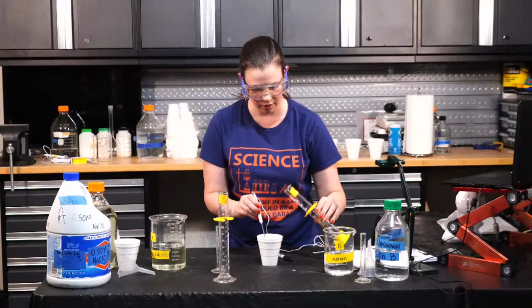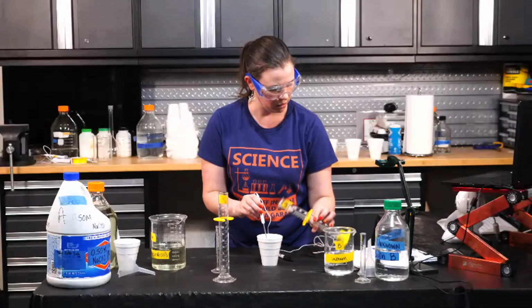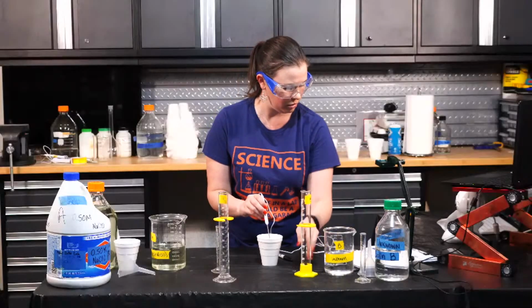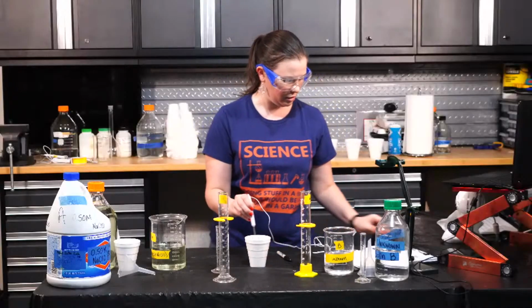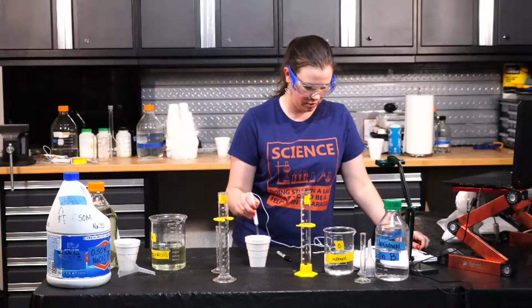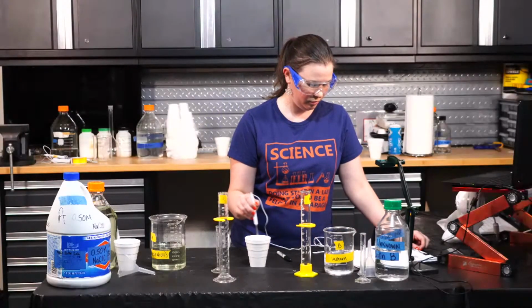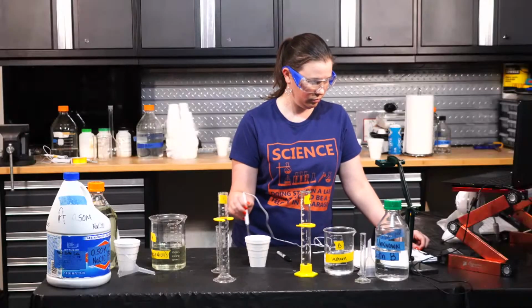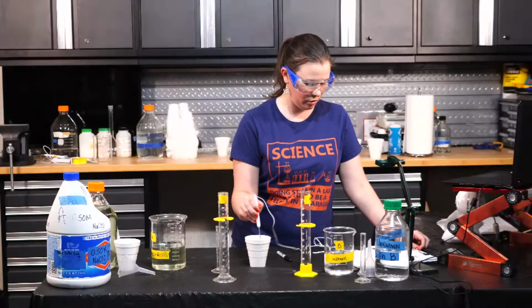So then we're going to add our 45 milliliters. All right, and we got 21.2, 21.3. Mix it. 21.4. 21.4.